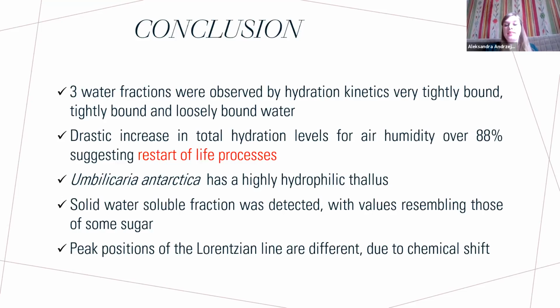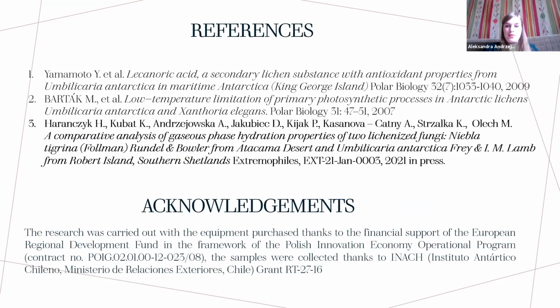Peak positions of the Lorentzian lines are different due to chemical shifts. And this is my reference. Thank you very much for your attention, and I will be happy to answer any questions in this poster session. Thank you, Aleksandra, very much.